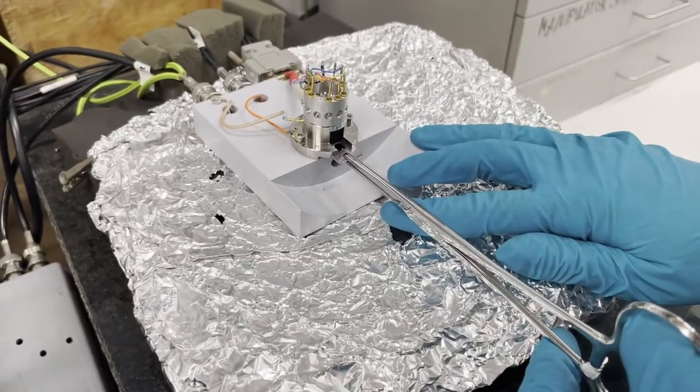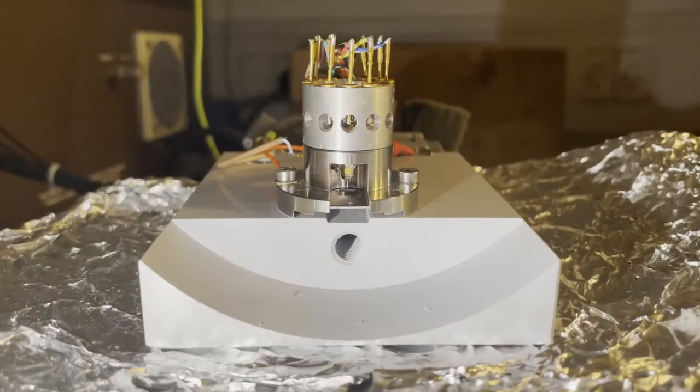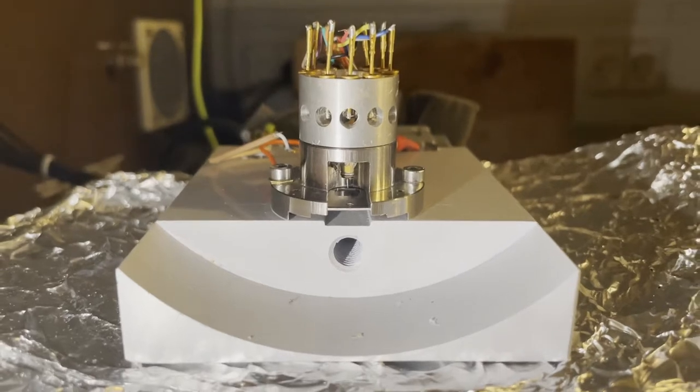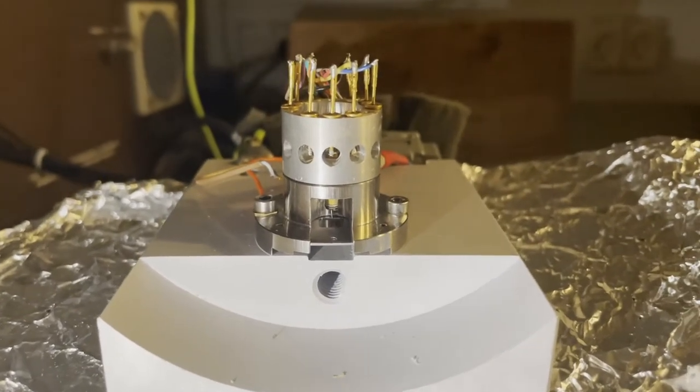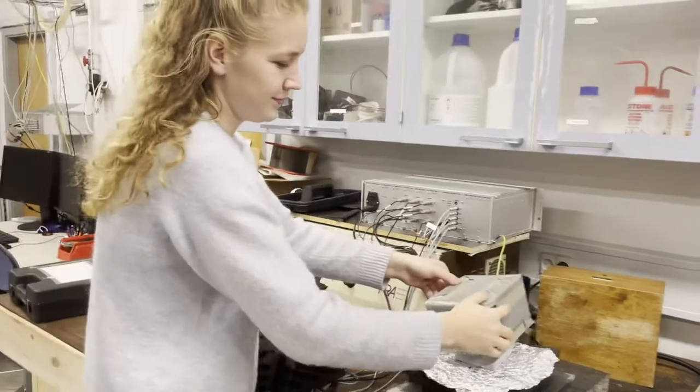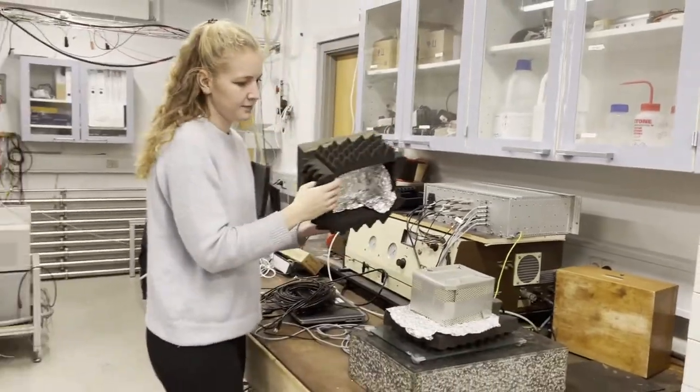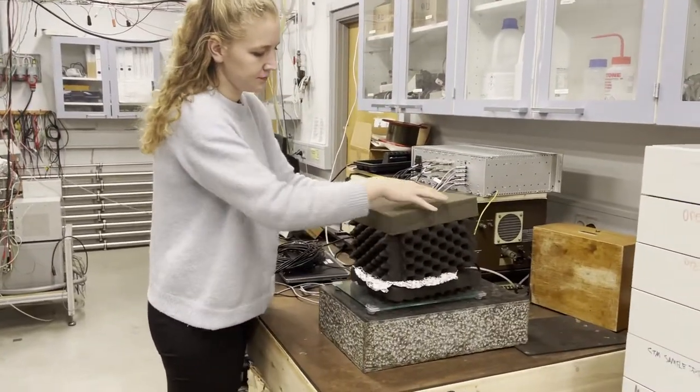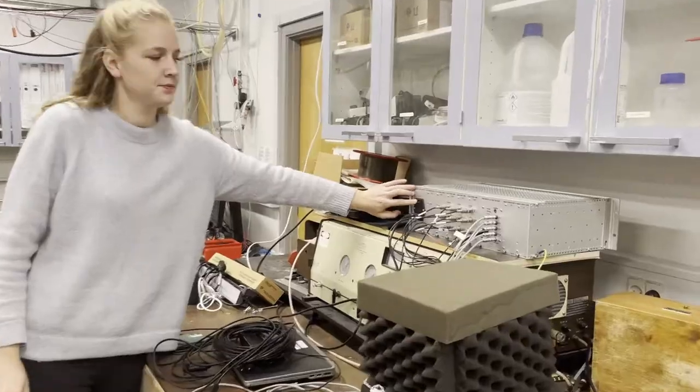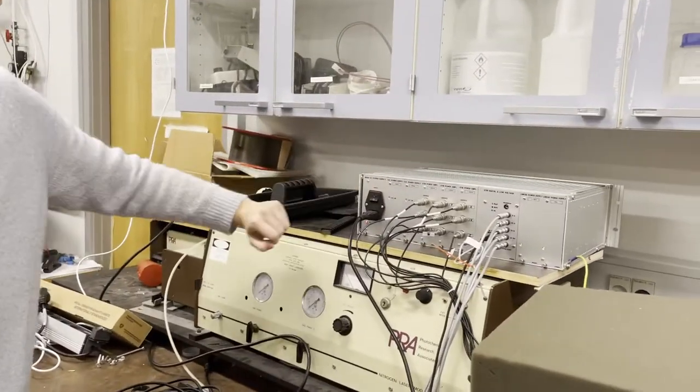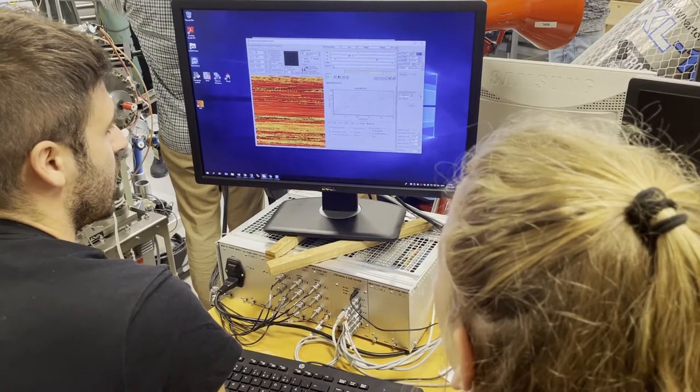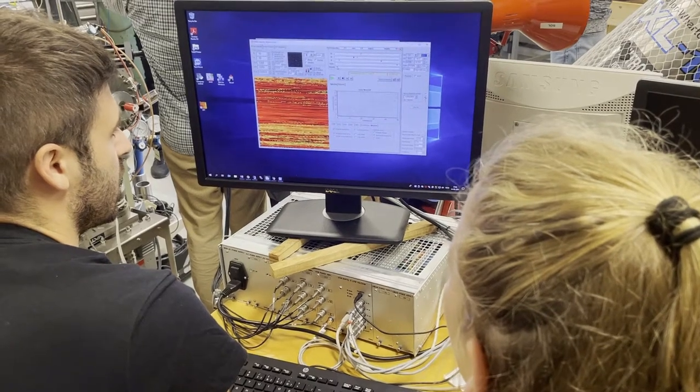We put the sample back in, and now you can see the tip close to the graphite. To protect our scanning tunneling microscope from any external noise, we surround it by foam. Then we can turn on the scanning tunneling microscope and we can approach the tip to the surface from the computer. Then we're ready to scan.